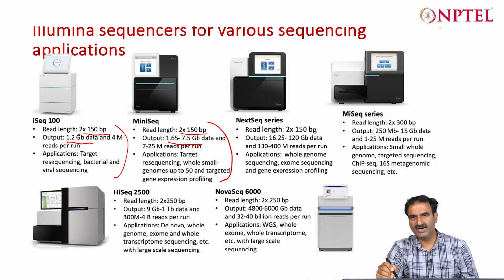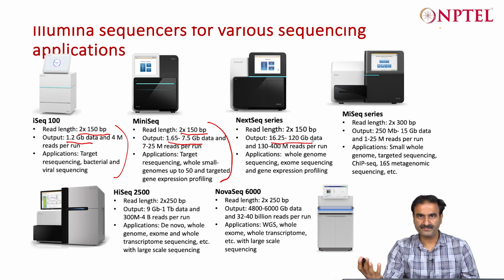Then NextSeq, which can produce up to 120 GB of data, which is good enough for a good genome resequencing, or even new sequencing, because genome sizes are typically from 5 MB to 3 billion base pairs if you see the range from bacteria to humans.